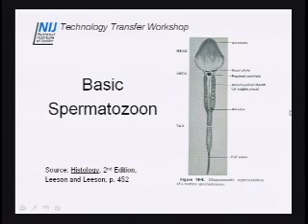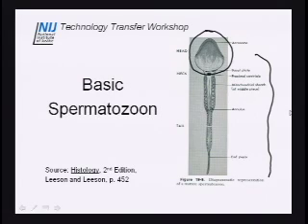Of course, we're not so interested in the more detailed things here. Of course, it would be nice if our sperm had the name written on the head or on the tail for us, but we're not so lucky. But generally, we're interested in the head, the neck, and the tail. And of course, the head especially, for our purposes, generally when there's Christmas tree staining, it's staining the nuclear material. So we're getting this area here.